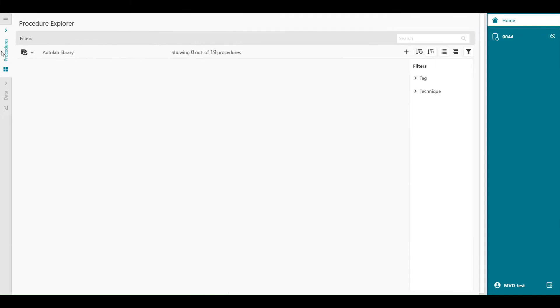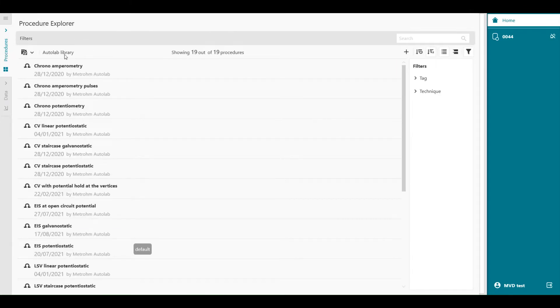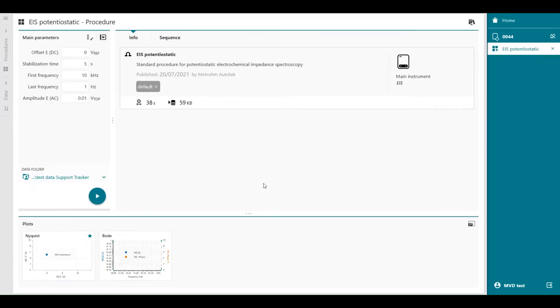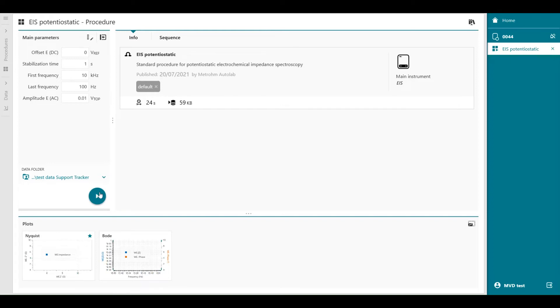So we go to Procedures. In the Autolab library you will find EIS potentiostatic. I'm going to change the stabilization time to 1 second and the last frequency to 100 Hz to speed up the measurement — this is just an example. The electrodes are connected to the Autolab test cell and after the measurement is finished you will find in the top right corner of the run the analyze data in Nova button. So we start the experiment.